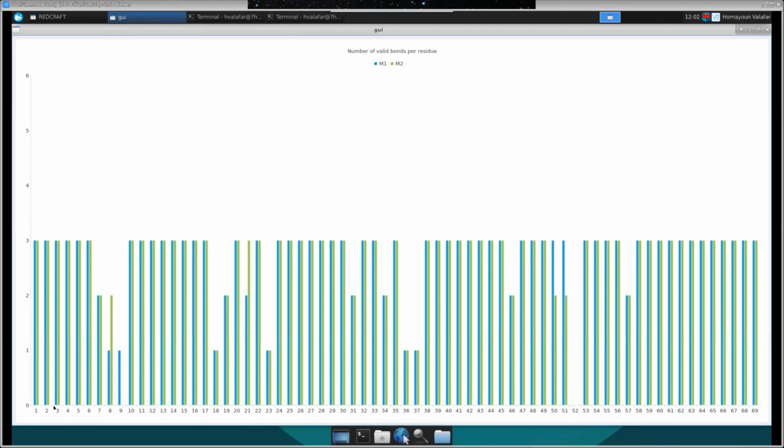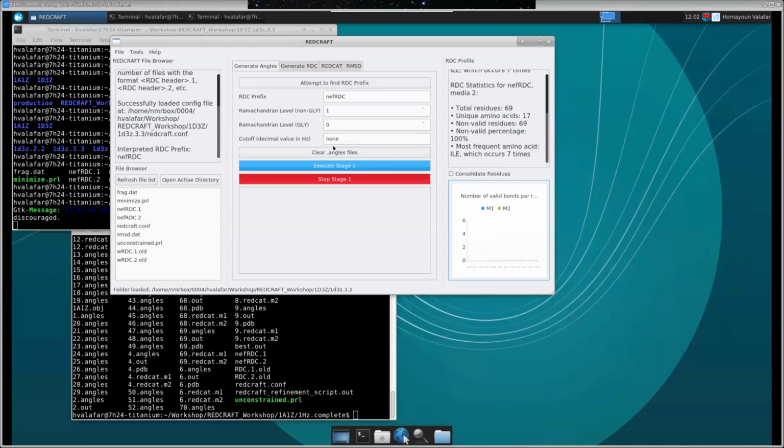In this particular instance, it turns out that residue 1 is just a fine place to start. So I'm going to start my calculation from residue 1. This one, by the way, I didn't mention anything.